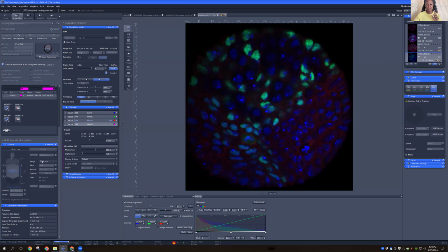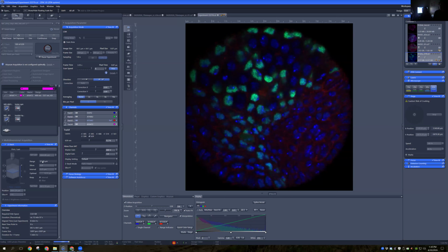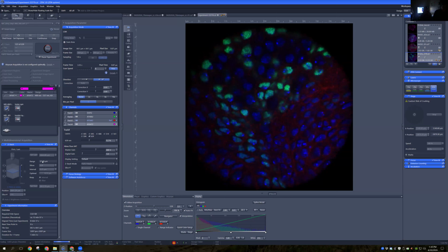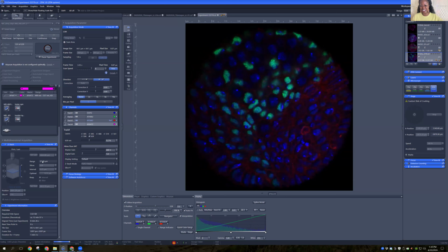So I have a question about the lab. Is this the Ruth Lehmann lab that you're in, Michaela? Yeah, my advisor's name is Ruth Lehmann, and she is a faculty member at MIT. She is a very well-known Drosophila biologist who's been studying germ cell biology in Drosophila for a very long time. Okay, I thought so. I wanted to check to be sure.